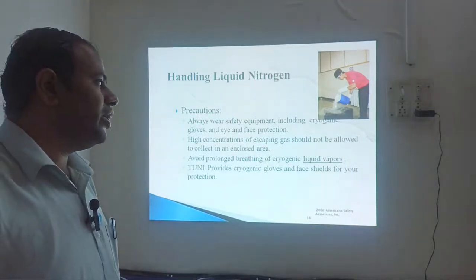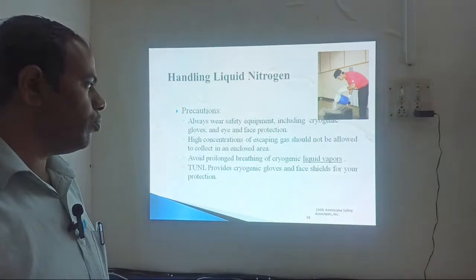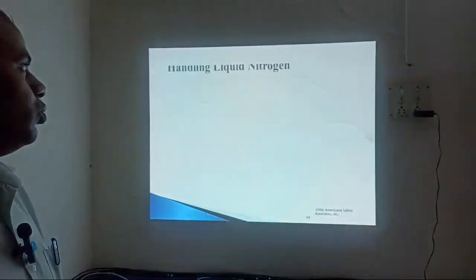Avoid prolonged breathing of cryogenic liquid vapors. Whatever vapors are there, you should not breathe them for a longer time. And these kinds of shields should be used.